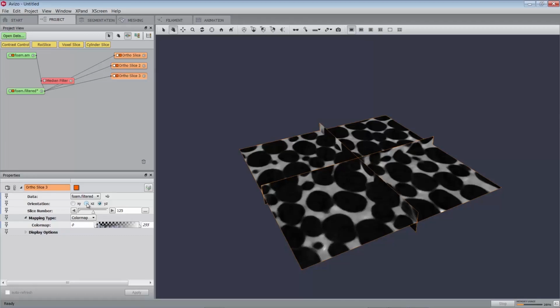We'll now talk about interpretation as 3D image or 2D image stack. Sometimes it can be useful to interpret the input data of an image processing algorithm as a 3D volume or as a sequence of 2D planes. For instance, a number of image filters and image processing algorithms can be performed on either each XY slice of the volume using a 2D kernel or on the whole volume using a 3D kernel. In some cases, it may be preferred to use the 2D algorithm either for performance or for more appropriate effect depending on the data and the desired outcome.